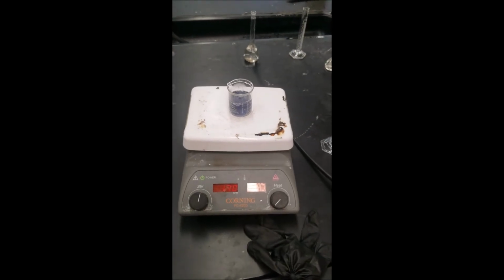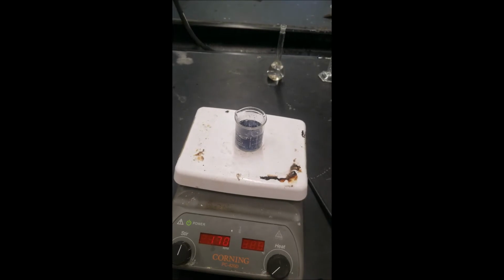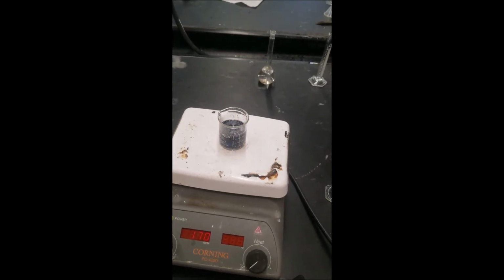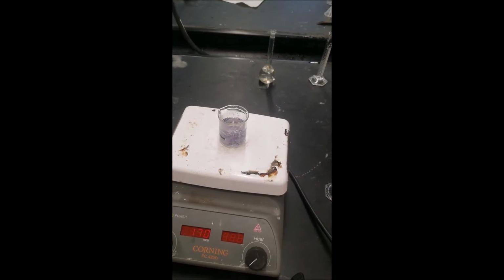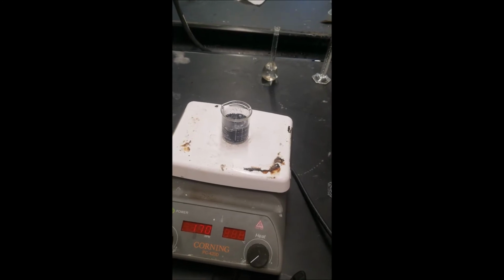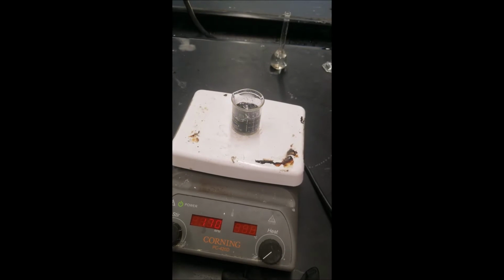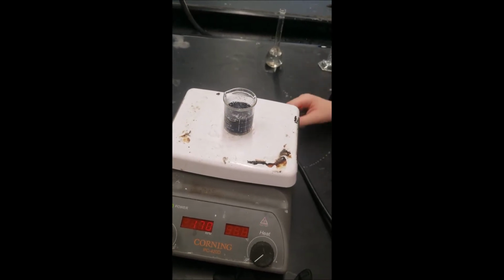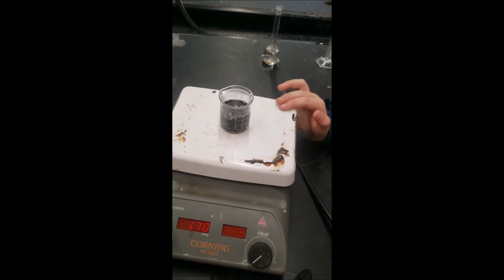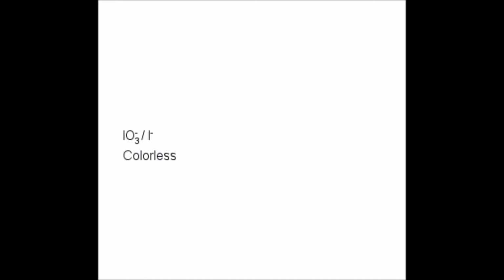So see, do you think this is going to keep going forever, or do you think it's going to stop at some point? I think it'll stop at some point. What did we just notice there? Well, it seems to be taking longer and longer to change into another color. This is also showing some kinetics, meaning the speed. It'll stop soon. So what did we actually observe?